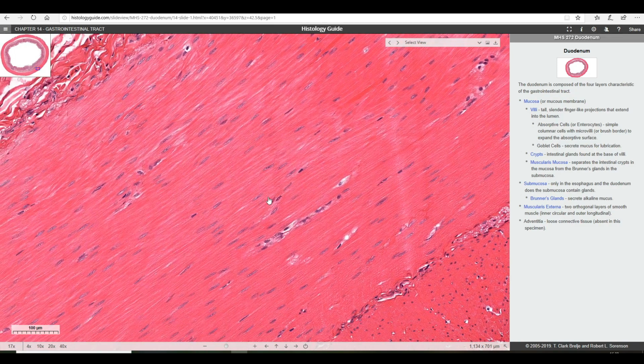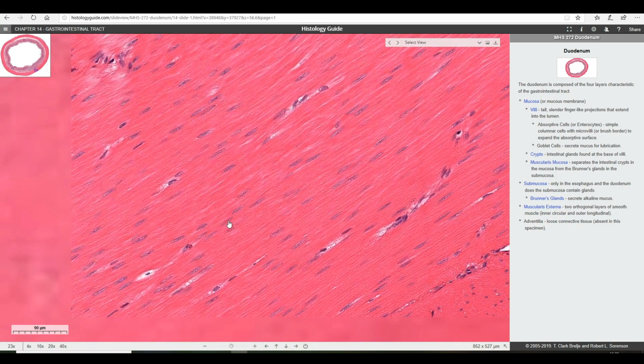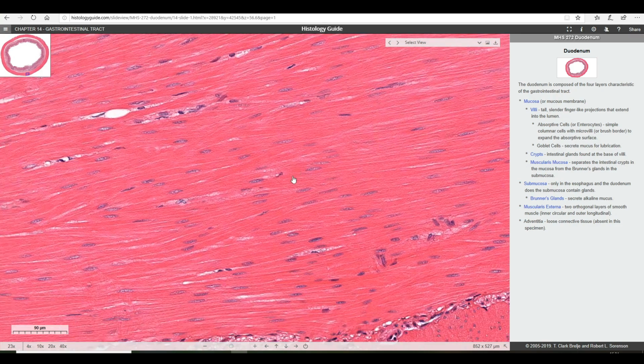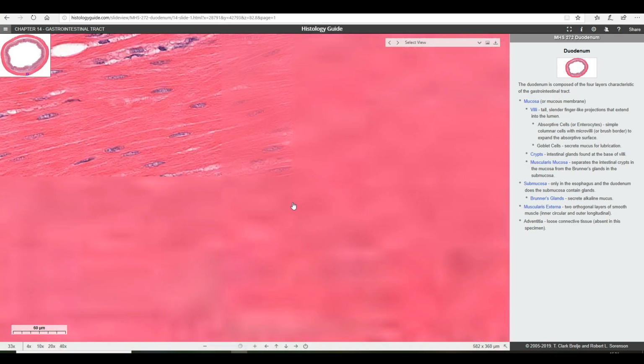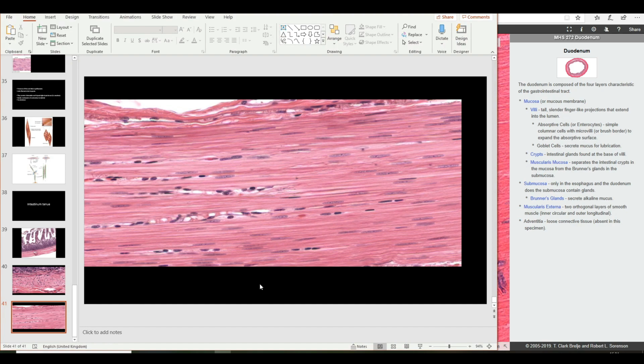So let's try to find a nucleus that is contracted. Here there is some sort of contraction, mild, not major. Again, we can see this movement, this change in the shape right here. There we go. Look at the shape, look at the change, look at the density of the nucleus right here. Way different than the typical cigar shape. So again, this is the difference between the smooth muscles.